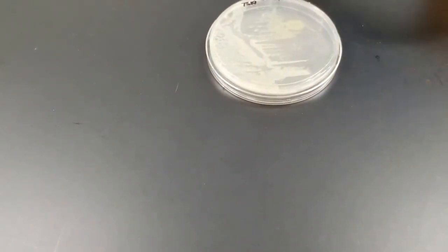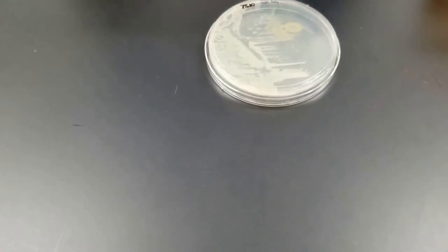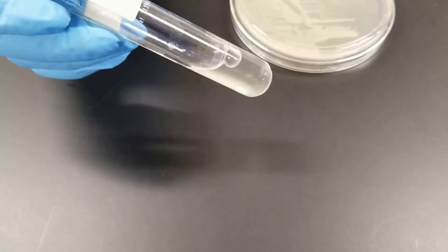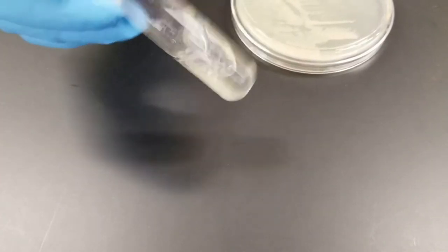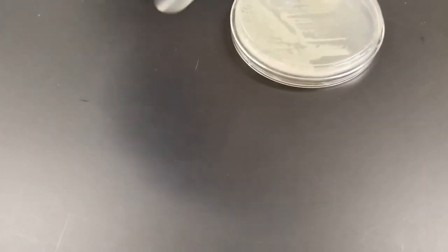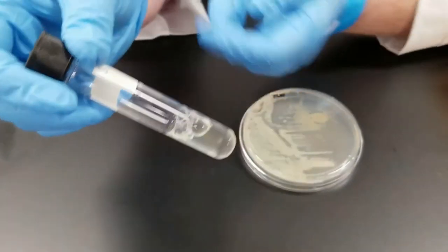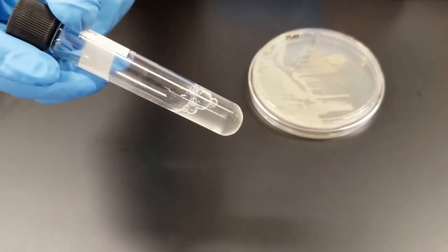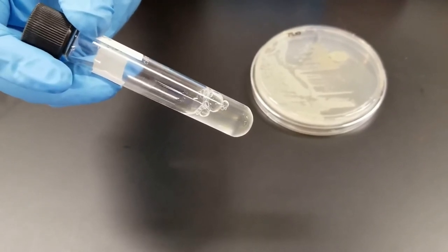Now we also grew this in a nutrient broth. So once again, we did get nice growth. Oftentimes when you grow bacteria, it tends to kind of settle along the bottom a bit, so you may have to swirl it a bit. Any cloudiness does indicate growth.